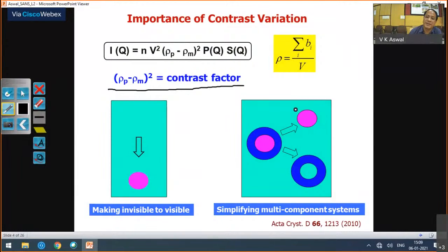So when you see just the core, you only have to get the radius of this core. And when you see it as a shell, if you already have got the radius of the core, you get the thickness of the shell. So you can see, you reduce the number of parameters and you can get reliable information about the system. So this can be done with neutrons and X-rays, or combining these two tools.